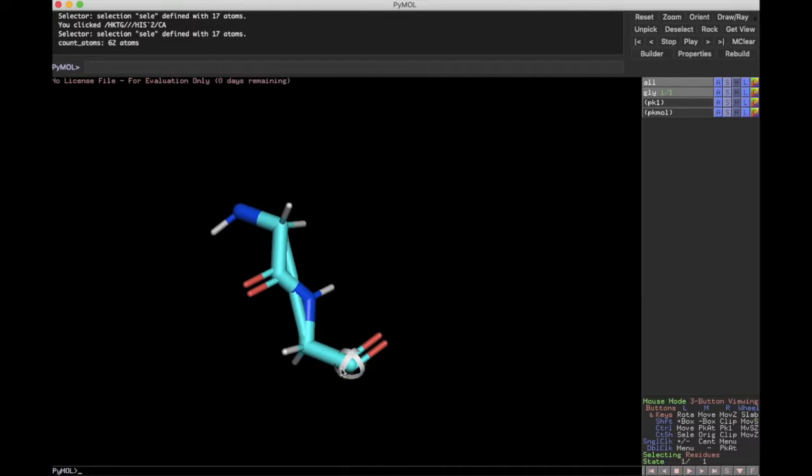Because remember, the C terminal amino acid, the amino acid at the very end, always has a free carboxylate group on it, all right? And in this case, it's just kind of showing this terminal carbon. We don't see the other oxygen here because that is where the next amino acid is going to be added onto. So we don't see the full picture here yet, but basically this little sphere, which if you look on the right here is PK1, is where the next residue will be added.